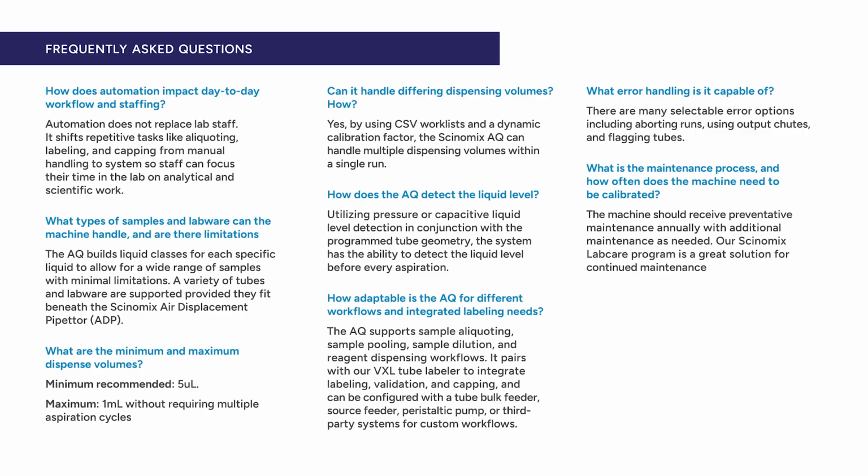Perfect. All right, Lucas. So how does automation, in your experience, impact the day-to-day workflow at individual labs and facilities? For sure, great question. So it's going to reduce that ergonomic strain that we've been talking about, and it's primarily going to get this out of the hands of users, and it's going to allow them to do that, again, high-value discovery work, the things that are more important than hand pipetting samples, right? And it's all about that walk-away time with automation, in my experience.